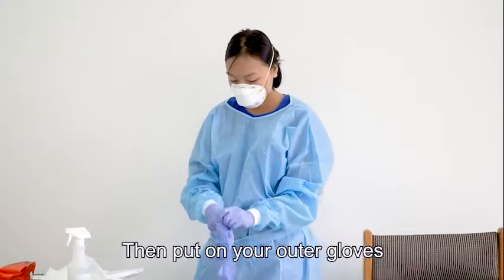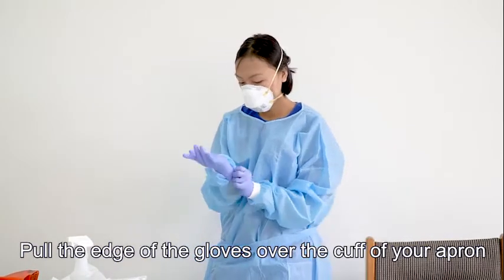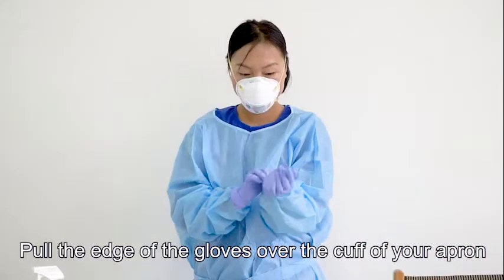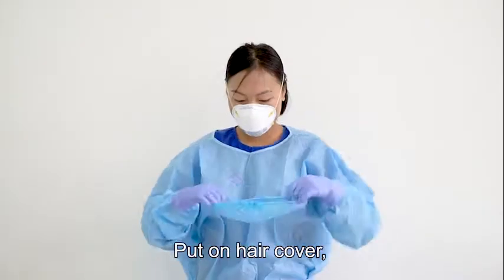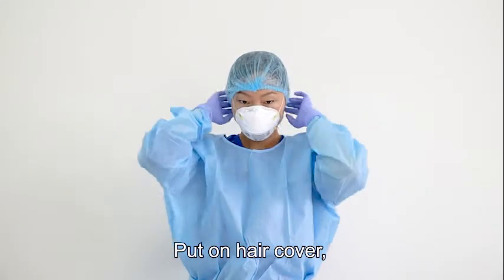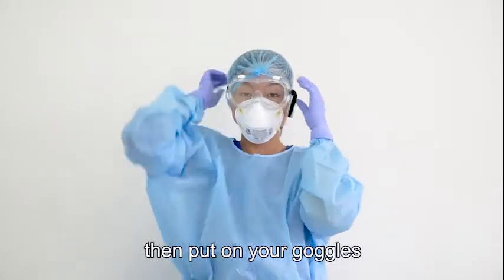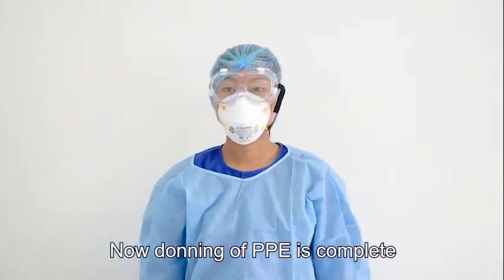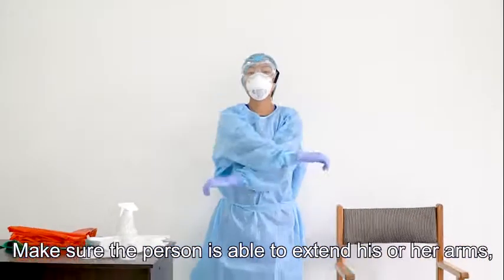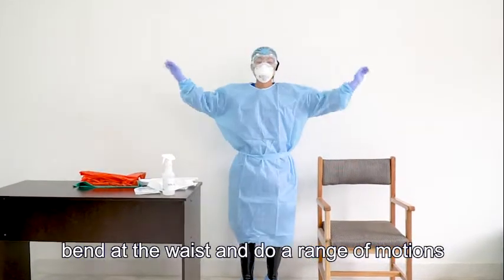Then put on your outer gloves. Pull the edge of the gloves over the cuff of your apron. Put on hair cover. And then put on your goggles. Now the donning of PPE is complete. Make sure the person is able to extend his or her arms, bend at the waist, and do a range of motions.